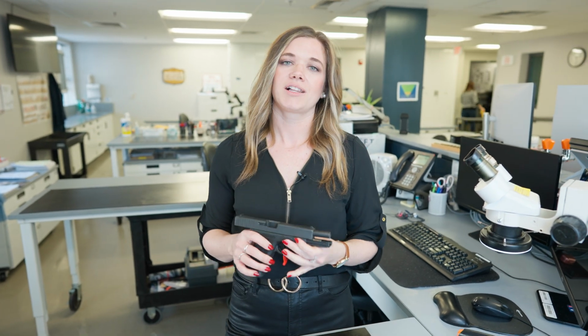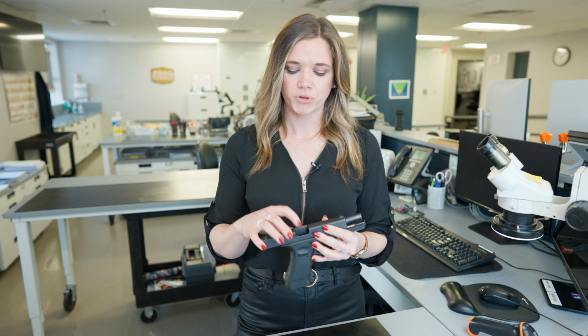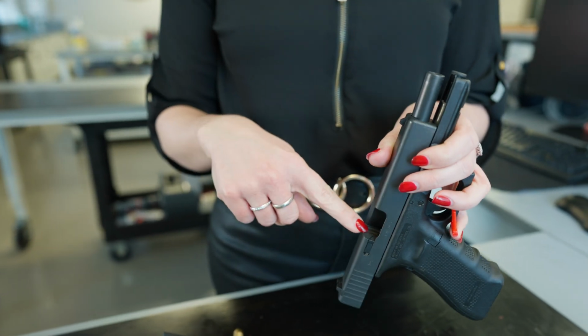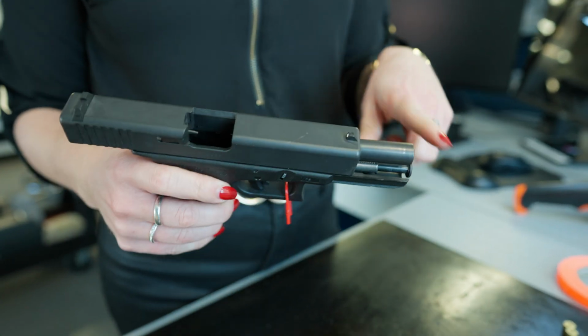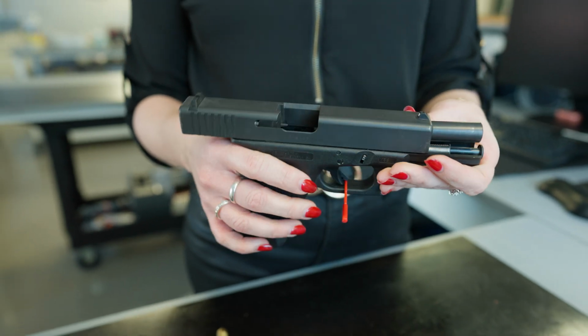In front of me here, I have a Glock firearm. As it travels through the cycle of operation, it is going to leave unique characteristics from this firearm onto a bullet and a cartridge case. Those marks are going to come from the extractor, the ejector, the breech face, chamber marks, as well as from the barrel itself. These marks are all identifiable from that cartridge case and that bullet back to this particular firearm. The markings left from the breech face, the ejector, the extractor, the chamber, and the barrel all leave unique characteristics on a cartridge and a bullet when they are fired through this particular firearm.